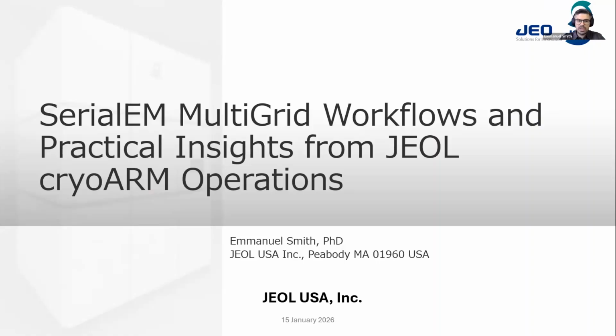So the topic today will be SerialEM MultiGrid, which is a relatively new feature that's quickly getting wide adoption across our cryoARM user base. Now, I'll talk about some of its basics, but mainly I'm going to show you how to do a data collection. Hopefully by the end of this talk, you'll be able to upgrade your SerialEM and start doing multi-sample data collection with SerialEM.